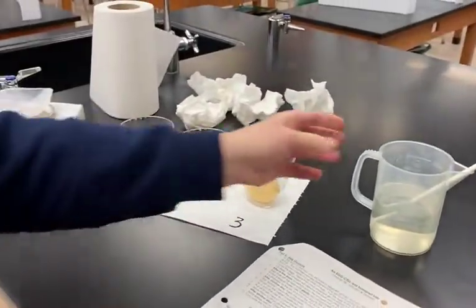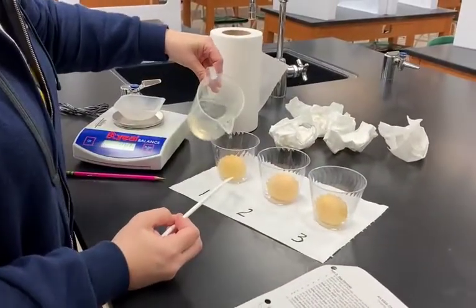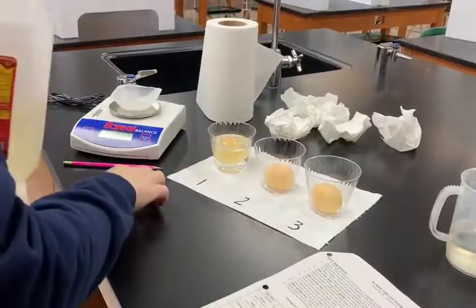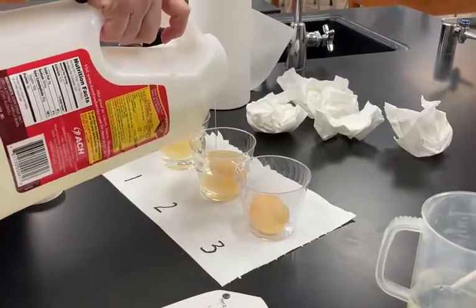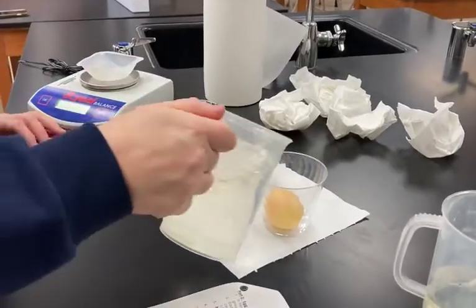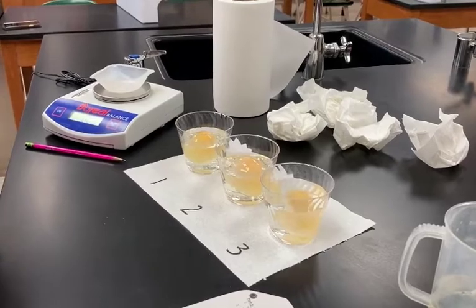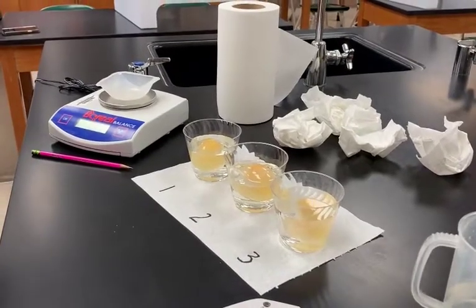Now we're going to add different solutions that have different concentrations of sugar in them. These three solutions we call solution one, solution two, and solution three. Solution one will go on egg one and cover it up, solution two will go on egg two, and solution three will go on egg three. These eggs need to sit a little while longer, anywhere between about four or five hours. Usually we just come back the next day, but we'll come back in a bit and see if osmosis occurred.